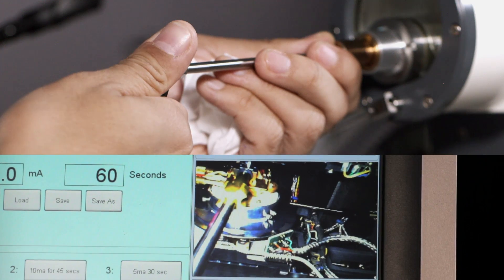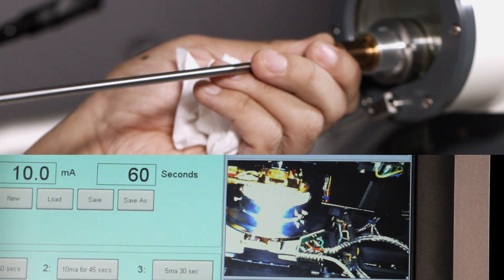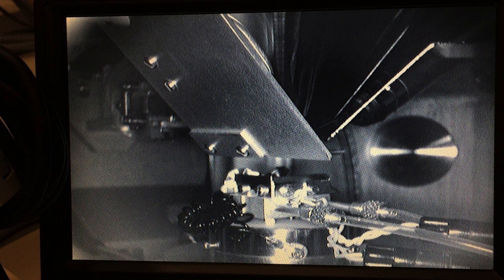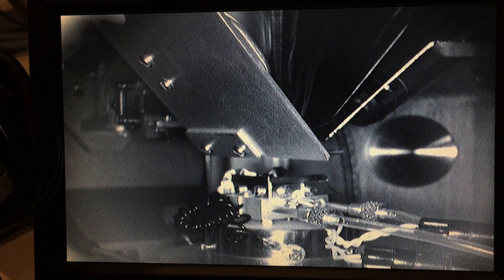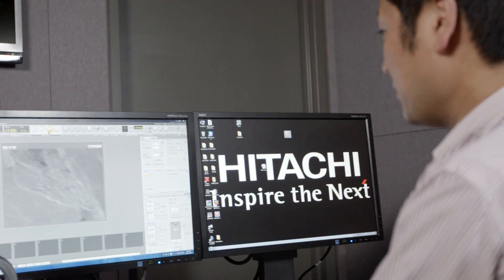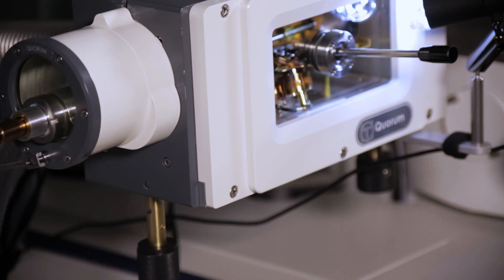Finally, the specimen is transferred under vacuum into the SEM chamber where it is located on a cold stage specifically tailored for the SEM. At all stages of the procedure, the specimen is maintained at a safe temperature of typically lower than minus 140 degrees Celsius by using anti-contaminators, which are located close to the cold stages in both the cryopreparation chamber and the Hitachi electron microscope, and typically maintained at close to the temperature of liquid nitrogen.